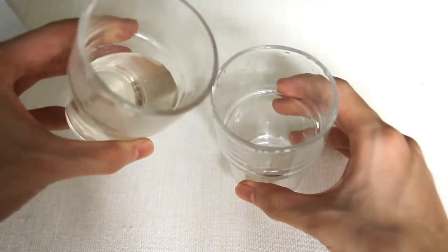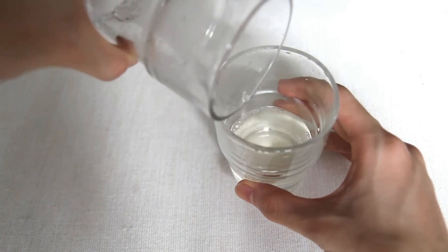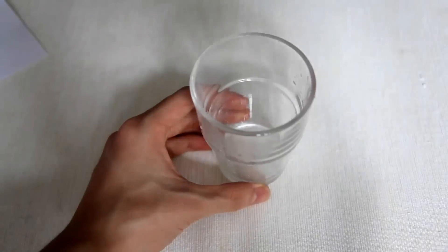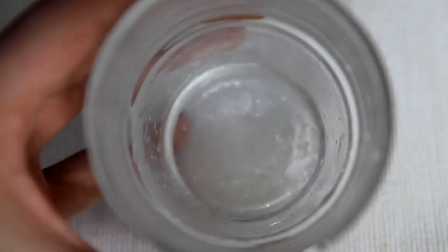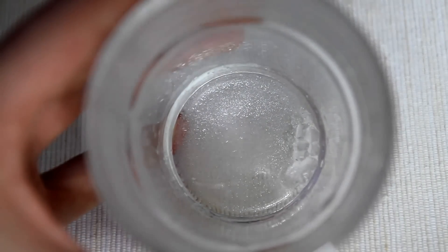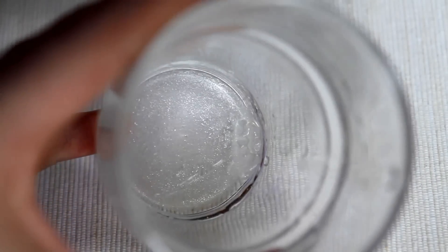slowly pour alum solution from the first jar into a clean jar. You can see some alum crystals at the bottom of the jar. These are seed crystals that you will use to grow a big crystal.